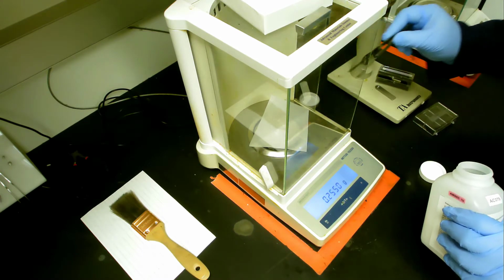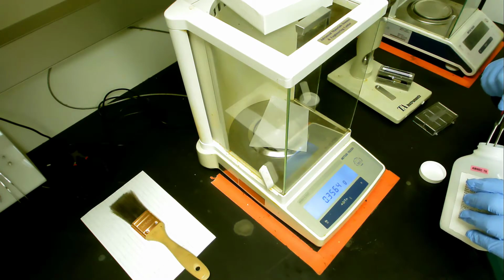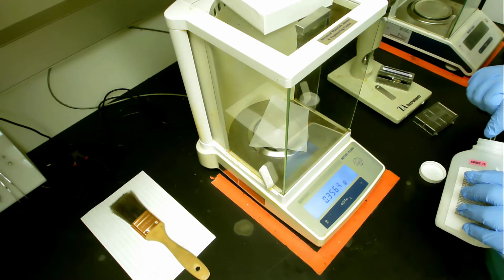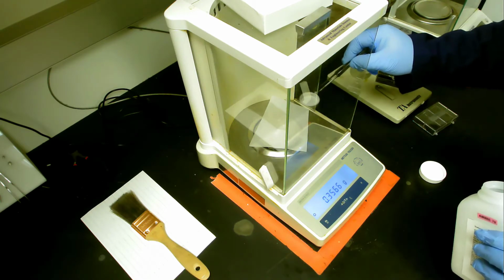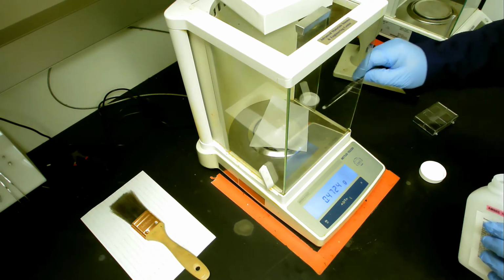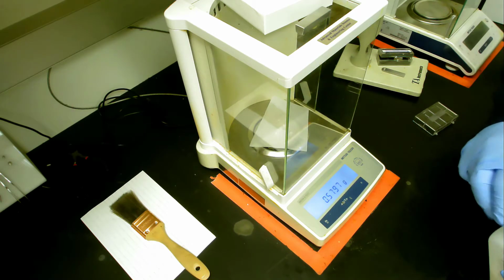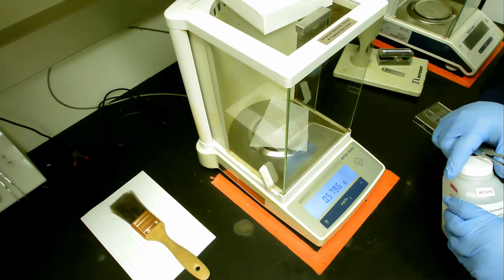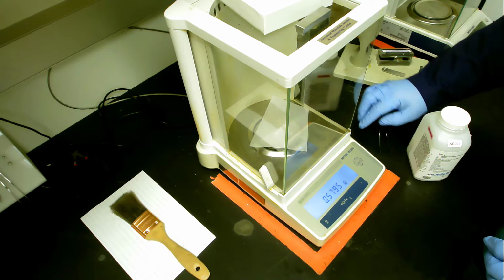These pellets are approximately 1/10 of a gram each, so usually we take about 5 of them. We don't have to be super accurate about this. We don't have to get right at 1/2 gram as the instructions call for, just because this is the catalyst used in our reaction and it's not going to mess it up if we're not spot on. So it looks like we're at around 0.58 grams, and that's going to be just fine for our purposes. The next step will be to transfer it to our mortar and pestle and grind it up.